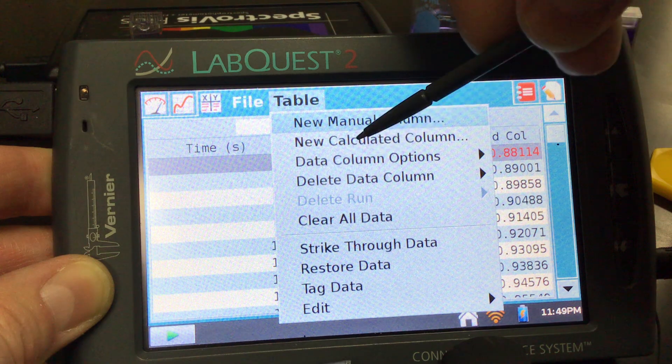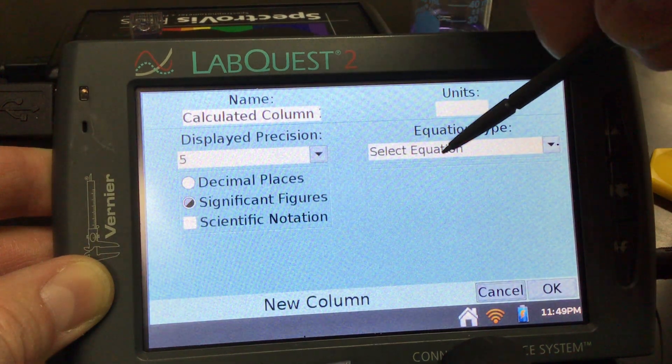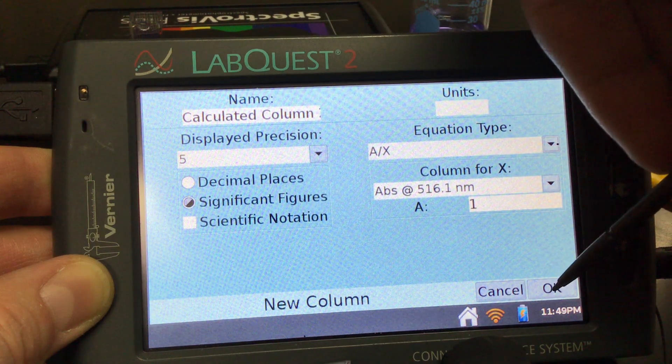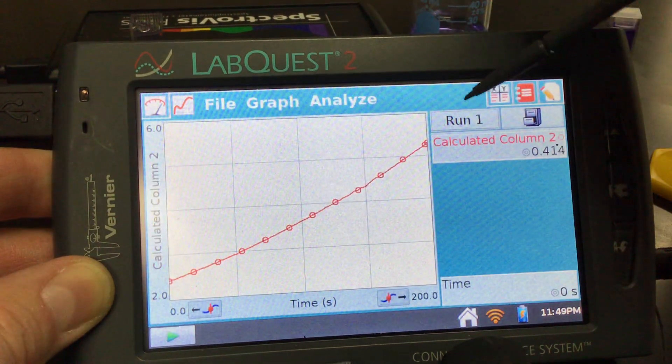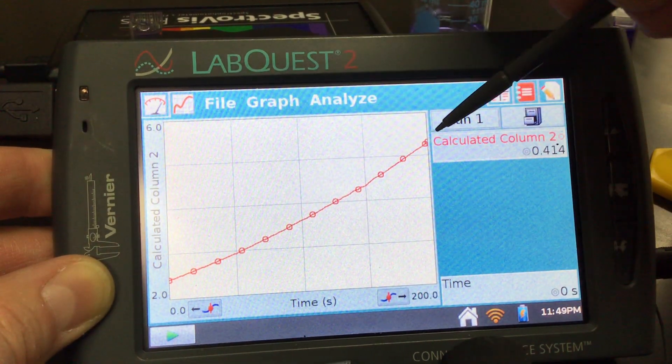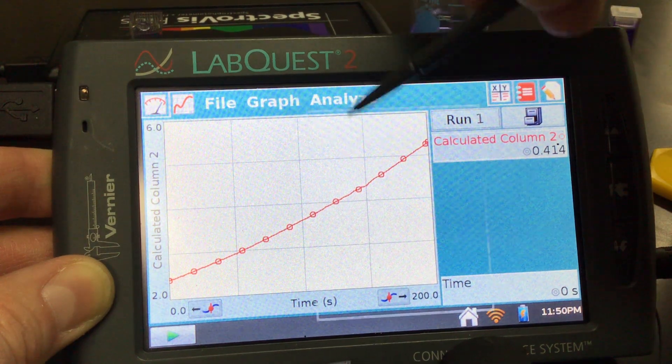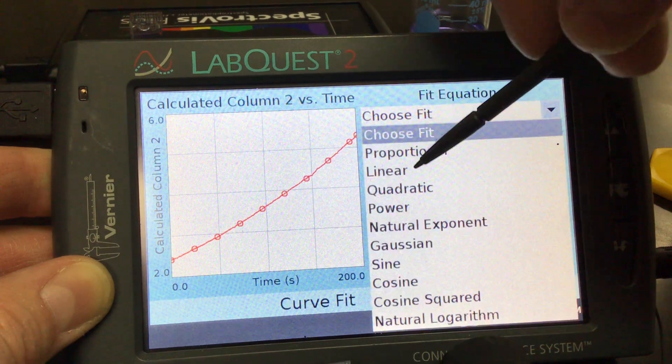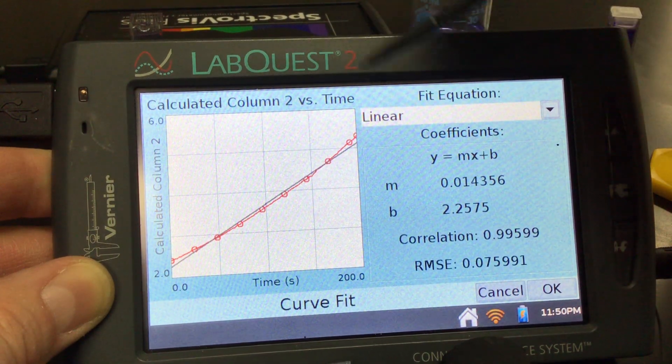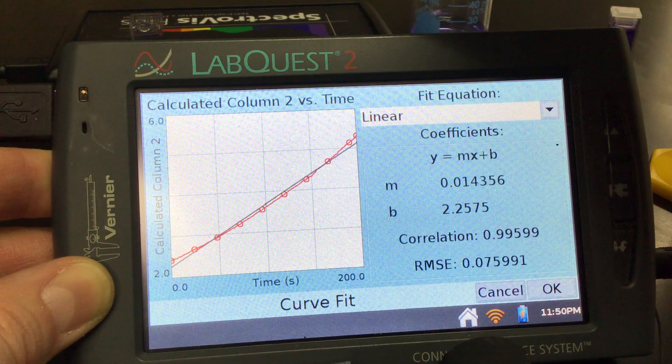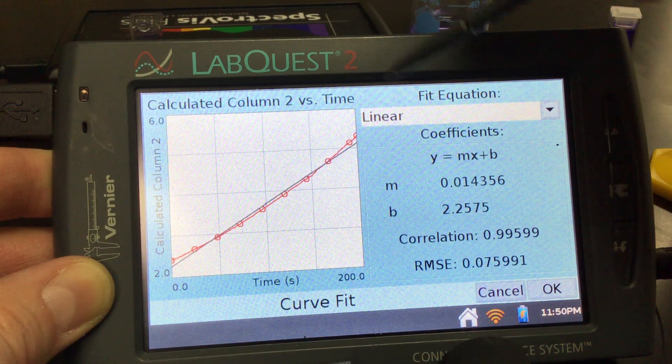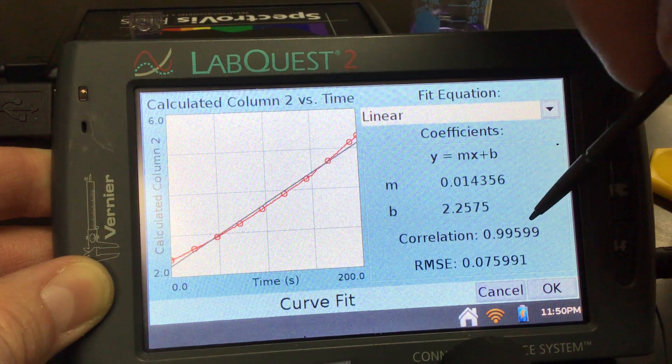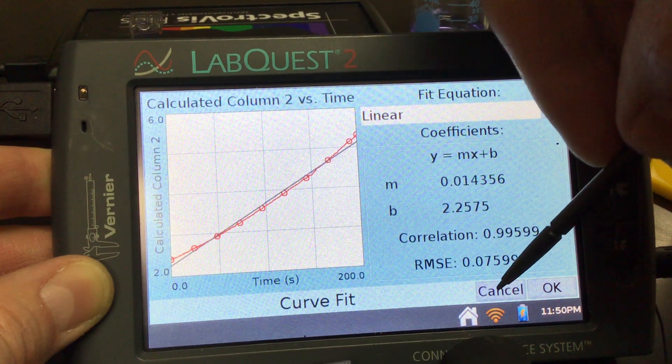What I'm going to do then is, just for poops and giggles, we're going to look at a new calculated column and we're going to do one over the concentration, which is absorbance. We see that it's upwards but it's sort of a curve too. Again, we can always look at a linear fit to see if it matches. Similar to zero order, it didn't really work out very linearly. This is decent but it's not nearly like the first order was.